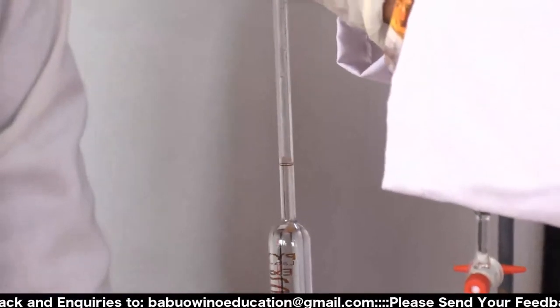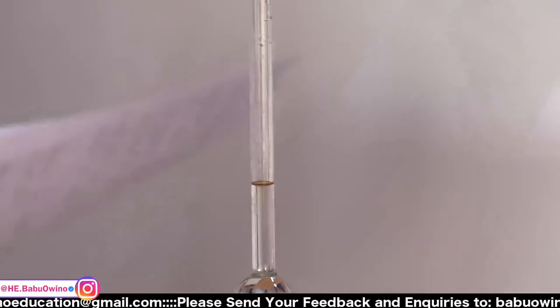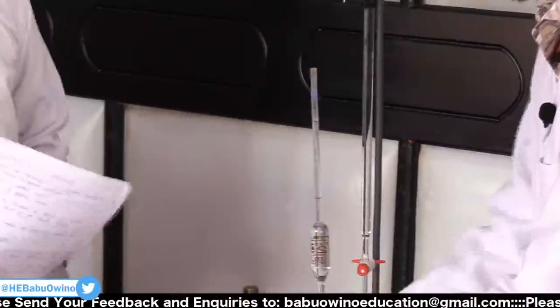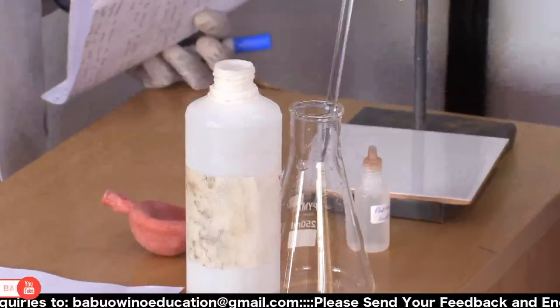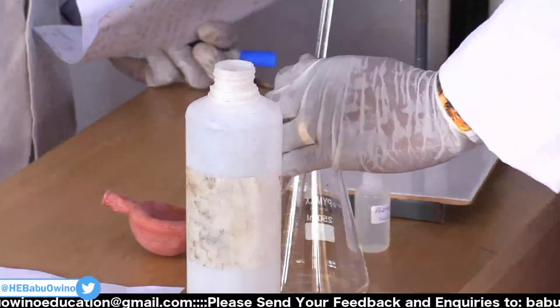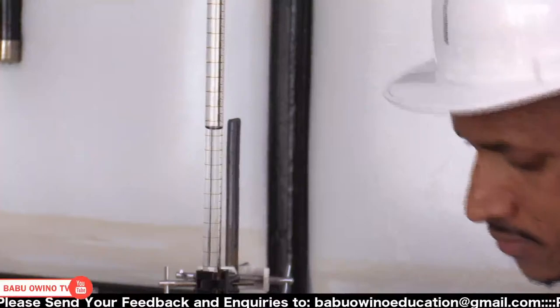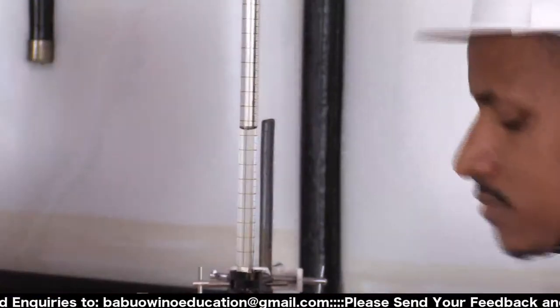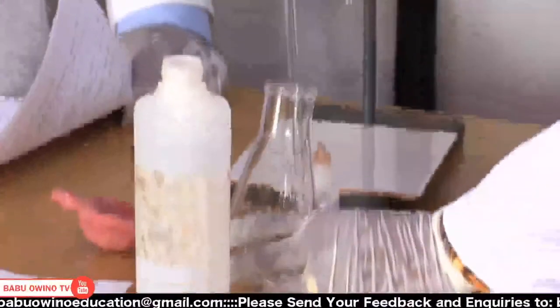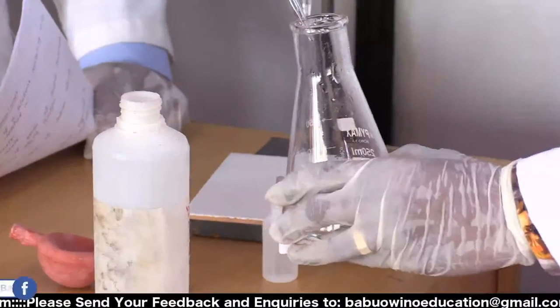Then you release it until it is level. The initial reading is 11.6. Then he fills the burette again.